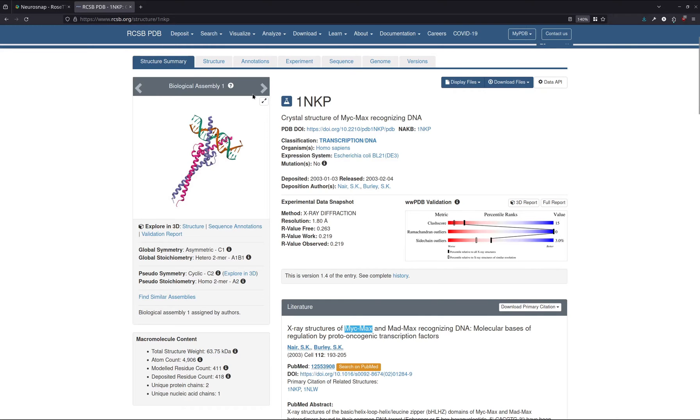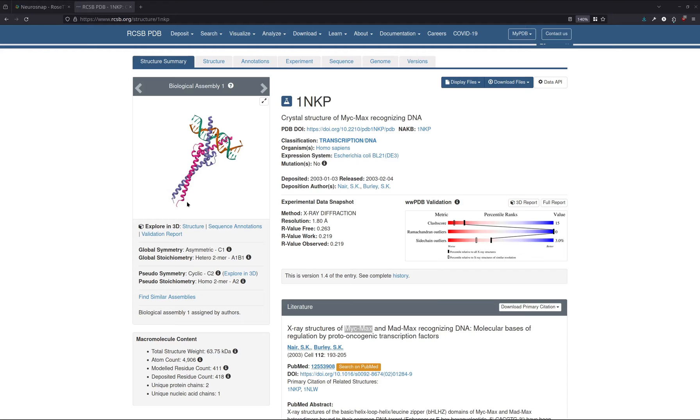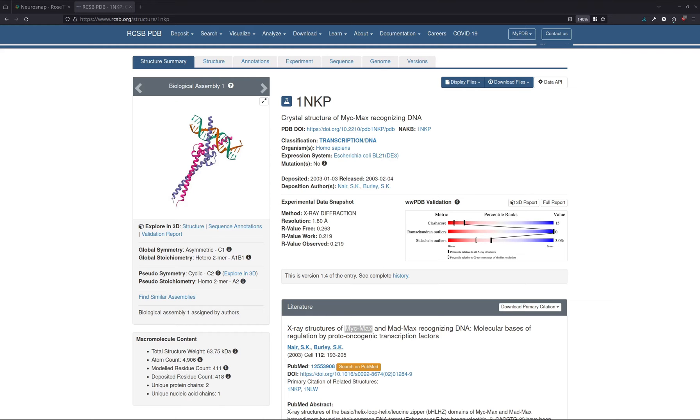Now, for the sake of this demonstration, we're going to be taking a look at the MYC-MAX complex when it's in complex with some DNA. These two proteins are transcription factors that play a crucial role in cell growth, proliferation, metabolism, and apoptosis. These proteins are generally part of a big network of genes that regulate the expression of other genes, making them central to many cellular processes. And MYC in particular is also an oncogene, which means it is involved in the transformation of cells into cancer cells when mutated or expressed at high levels. For that reason, we're really going to be focusing on this complex within this demonstration.